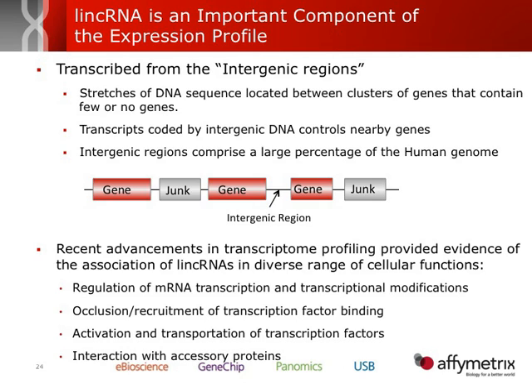Also, I don't want to leave out lincRNA. We tend to skip over this, but it's really important. In fact, in the paper that I discussed about the eye malignancies just a few minutes ago, they found that alternative splicing was also happening in a long intergenic non-coding RNA, which is an important regulatory factor in cancergenesis. So it's important not only to look at the coding regions, but also the non-coding RNAs. These become very important regulatory mechanisms, and they also have a very big effect in transcriptional modification. We're seeing that these become very important in things like cancer research.